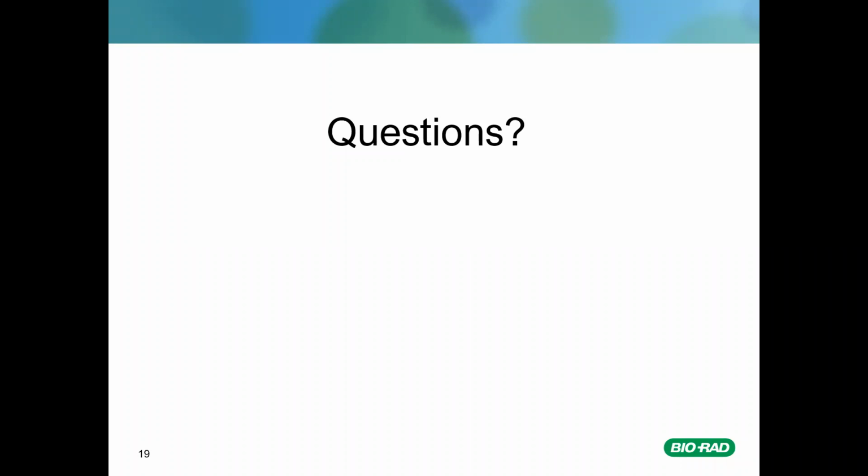So I know I should know this, and I did at one time. I'm kind of curious, what is the sensitivity of the DNA binding dyes? I know about ethidium bromide, of course, and SYBR Green. What was the other one? EvaGreen? EvaGreen is one too. So why is that being used? I'm just curious.